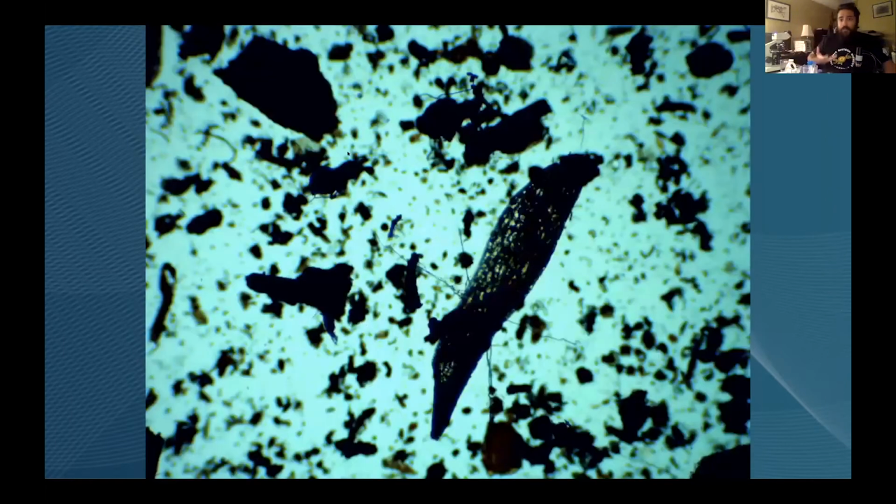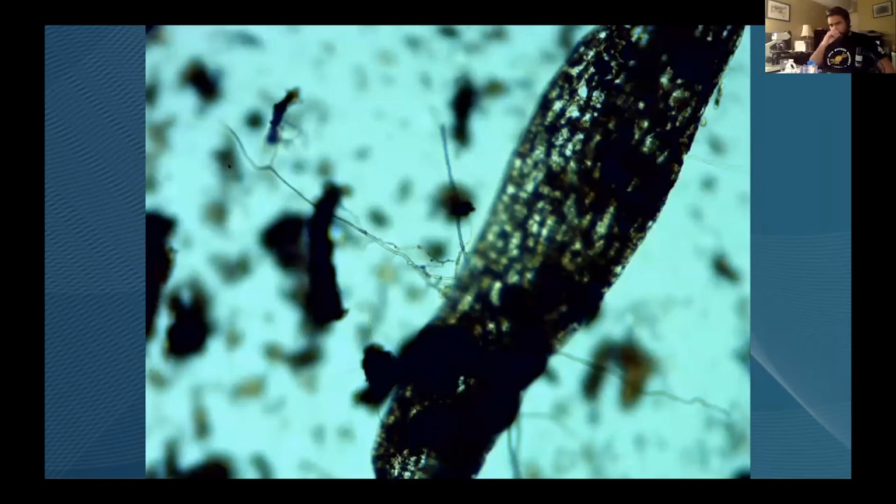So here's an example of what a healthy soil will look like under the microscope. We see lots of structure. We see that this isn't all compacted together. We see little nuggets of these humic, fulvic, and ulmic substances, these little dark spots which bacteria are basically clinging to. They make these alkaline glues and bind to them. But then, much like a bridge, the individual blocks of the bridge, you have the fungi acting like girders, pulling it all together, making this macro ecology.